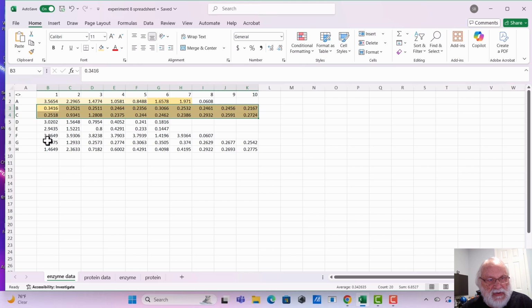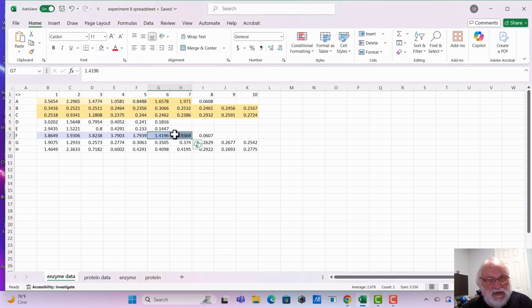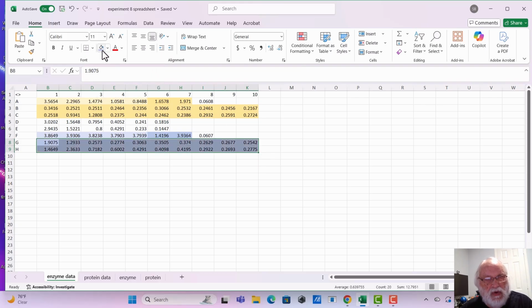Let's go ahead and do the mutant fraction, because this is the wild type, and this is the mutant fraction. The first 5 were that dilution of that extract. The next 2 we'll make a darker blue because those are the 2 load fractions, and then these 20 samples right here are all going to be the wash, the 0.1, 0.3, and 0.6 molar elution.